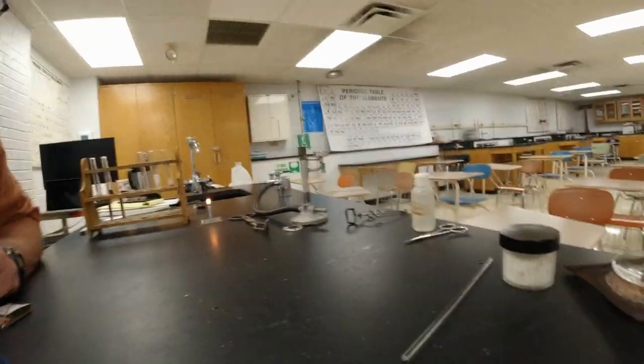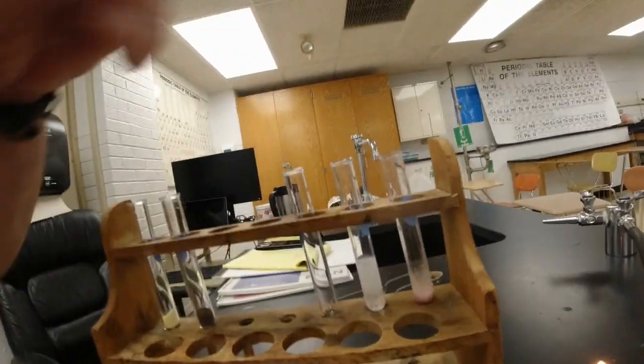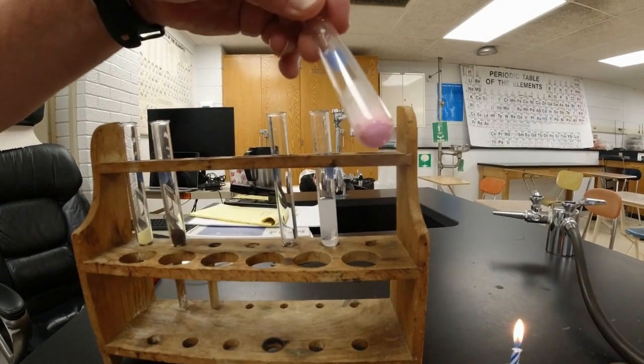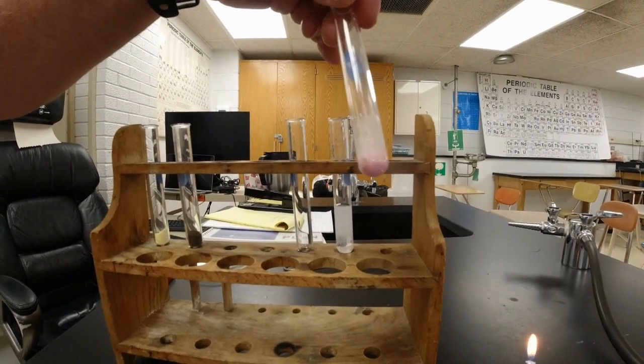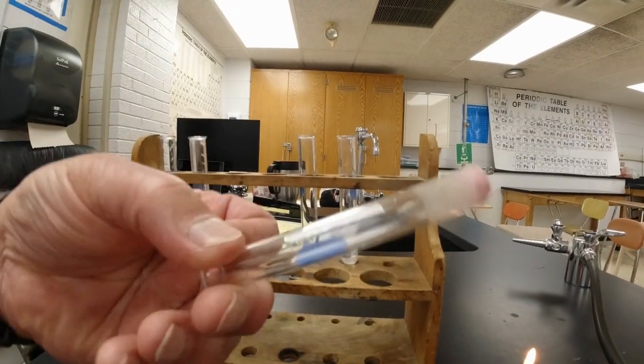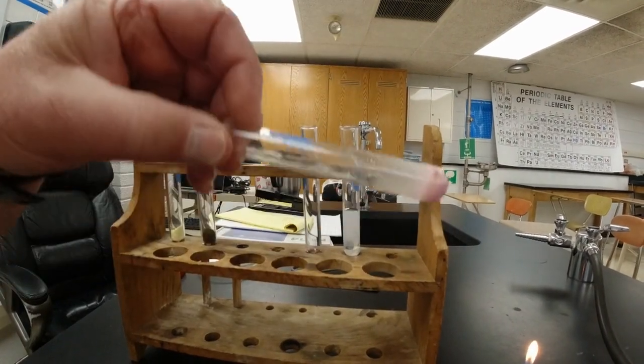Now, while you're doing that, let's look at the candle wax. The candle wax is completely solid. Right? It's re-solidified. It's got a pink color to it. Again, that's probably the coloring from before. But if I turn this upside down, there's nothing liquid going to pour out of it.